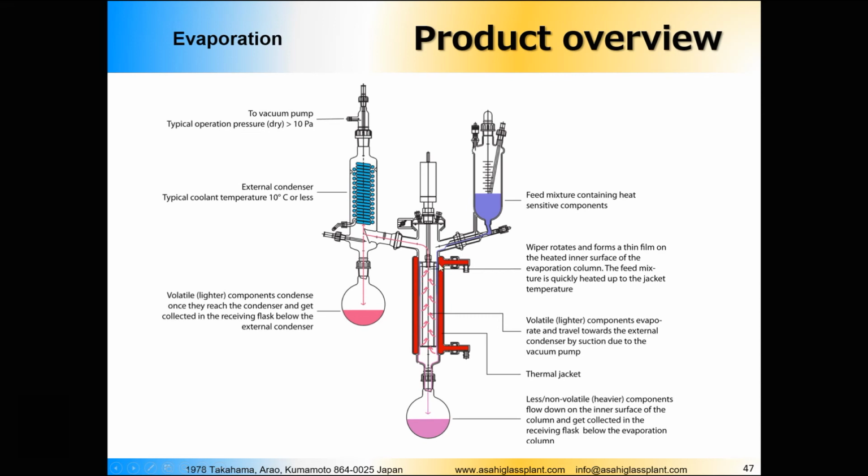So the advantage is that we can easily evaporate the thermolabile substances. Why? Because the time the evaporating mixture is in contact with the heat exchanger is relatively low. It is actually by gravity.